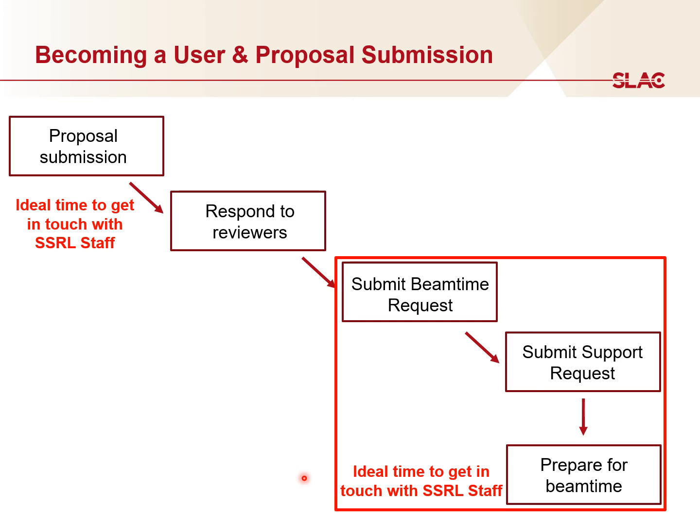New users are encouraged to get in touch with beamline staff prior to arrival for the experiment time. It is important for the beamline staff to know in advance of anything unique about your samples or experimental setup so that they can be prepared and help to advise you on data collection. As a reminder, you must go through this process in order to collect any data at SSRL.